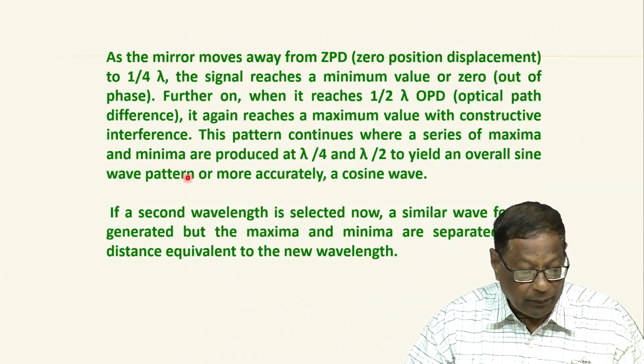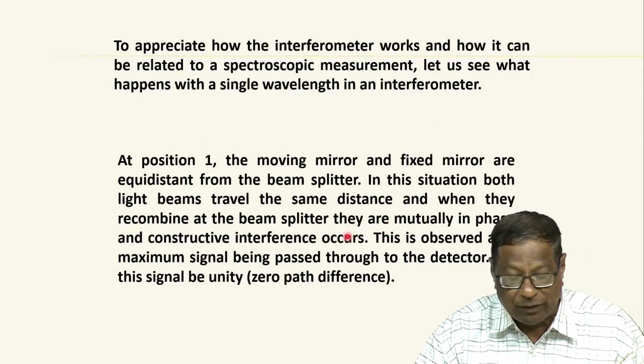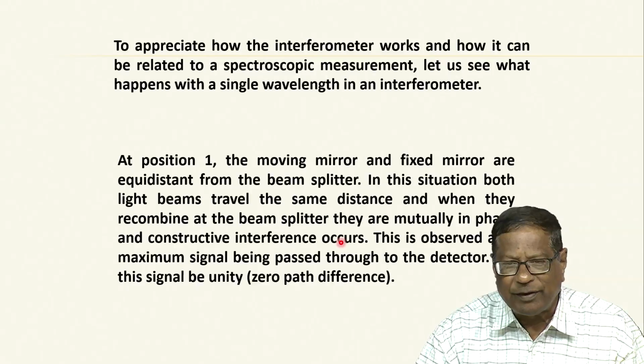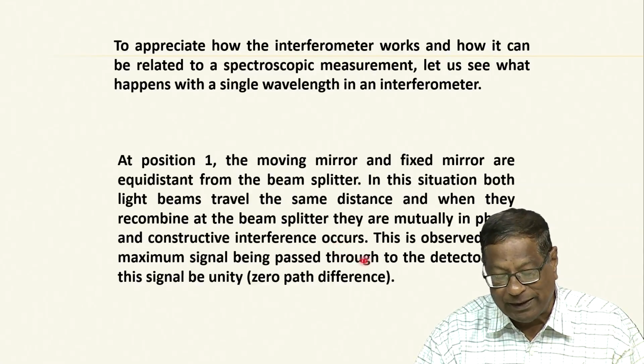So, when they recombine at the beam splitter, they are mutually in phase and there is only constructive interference. Again, basic physics, I will not go into details.